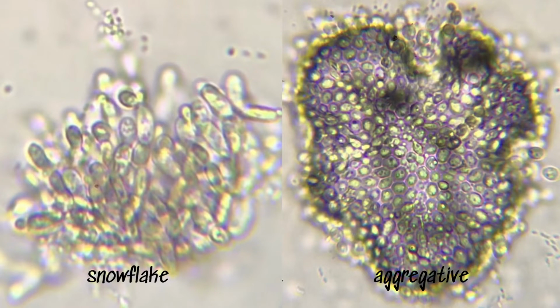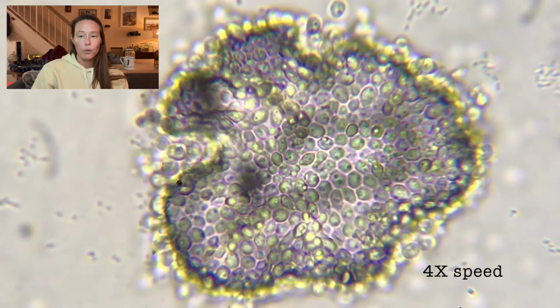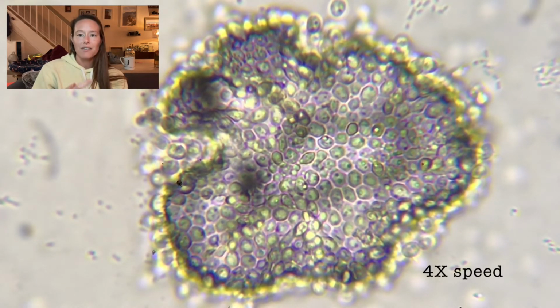The colonies of the yeast are also really interesting because the colonies are standalone as well as co-colonizing with the bacteria that are present. And the actual growth form of these colonies is kind of all over the place. These yeast colonies are both aggregative and snowflake growth forms. This colony in particular was really fascinating to me because of how tightly packed they are, and also how all of them had these dancing bodies, these volutin granules within their vacuoles.